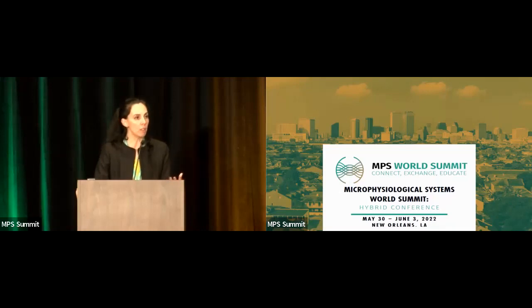You need to let the system mature, and this takes basically 2 weeks, 10 to 14 days with differentiation medium, to be sure that the cells already produce a sufficient pericellular matrix that will enable them to feel these forces that we are exposing them to. In that way, we can also see the remodeling of the matrix later on as an effect of these pro-inflammatory responses. Thank you.